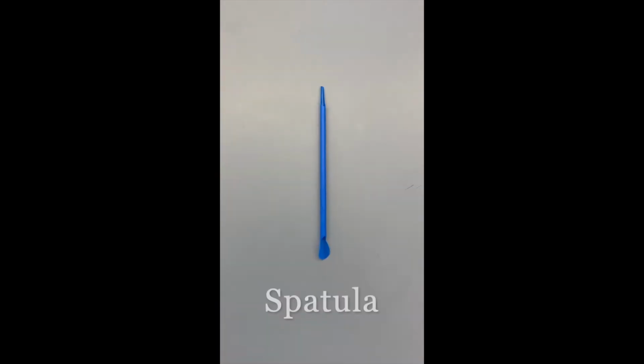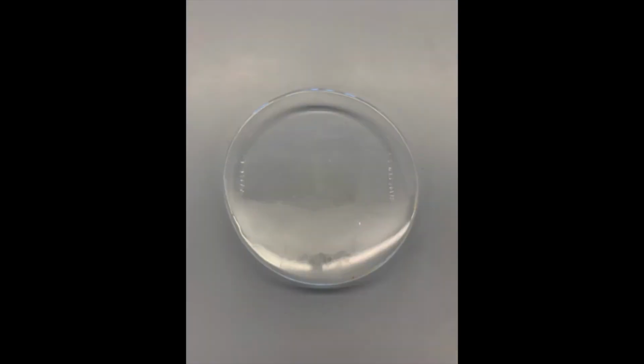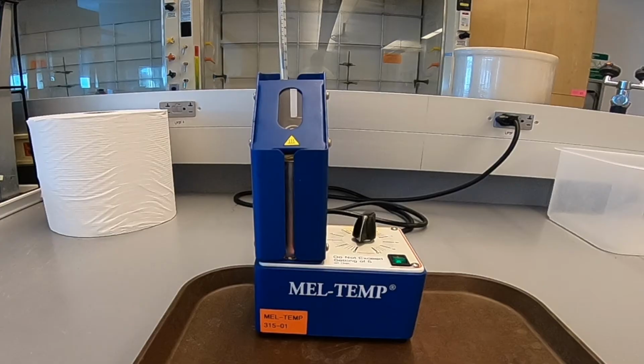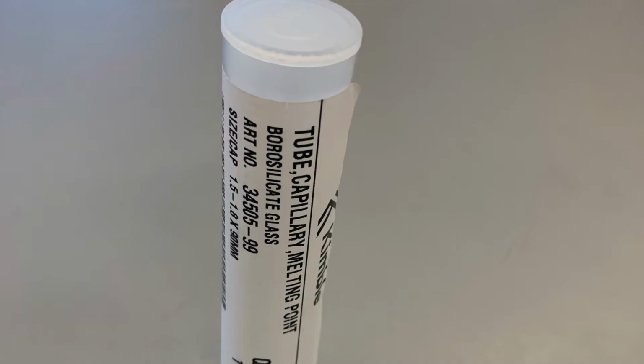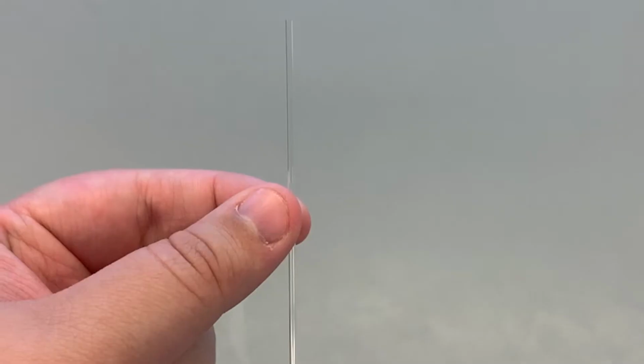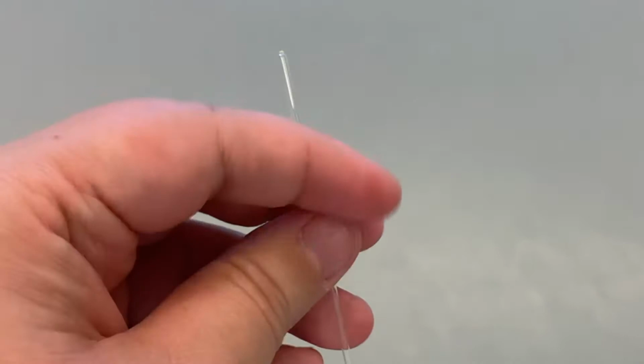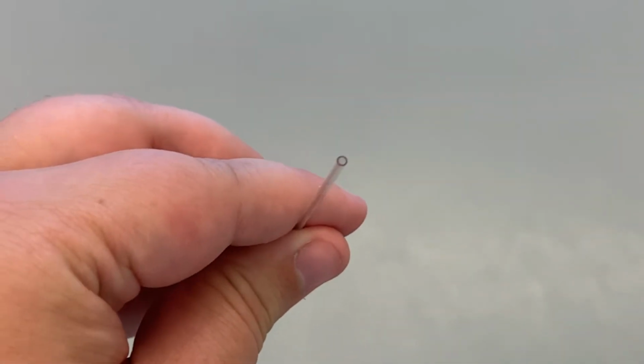When taking the melting point of your solid, you will need a capillary tube, which should be available on the benches next to the Mel Temp, a spatula, your dried solid with its expected melting point, a watch glass, and the Mel Temp itself. Capillary tubes, also called melting point tubes or melting point capillaries, are thin tubes with one closed end and one open end. These are used to hold your sample in the Mel Temp.